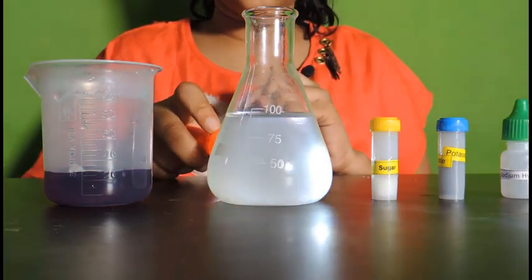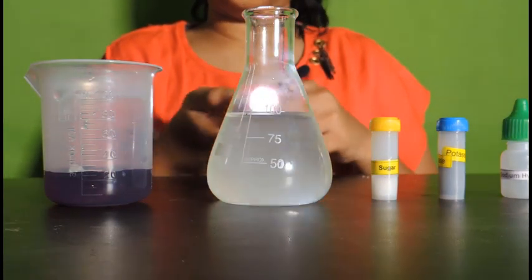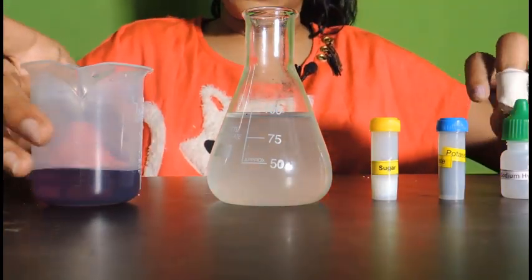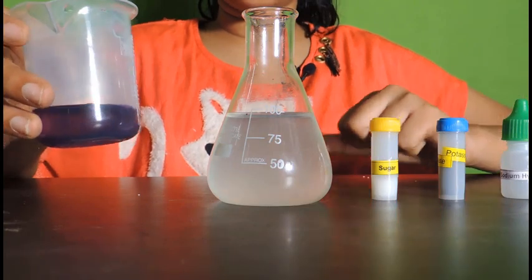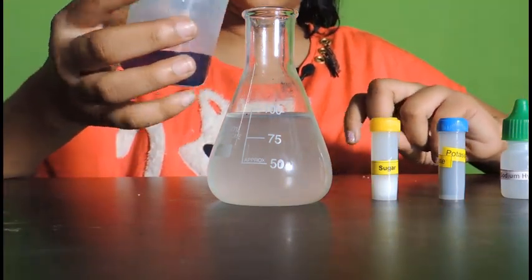You can see the alkaline solution of sugar. Here the sugar acts as a reducing agent. Now let's add 20 ml of potassium permanganate solution into the sugar and sodium hydroxide solution.